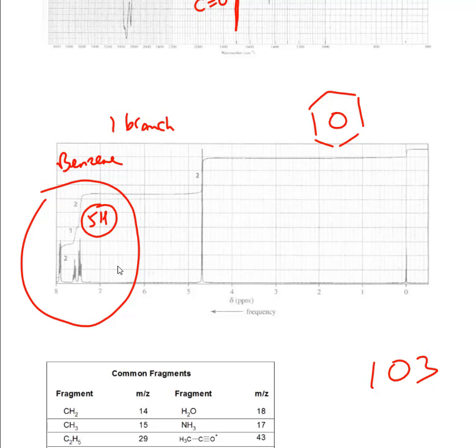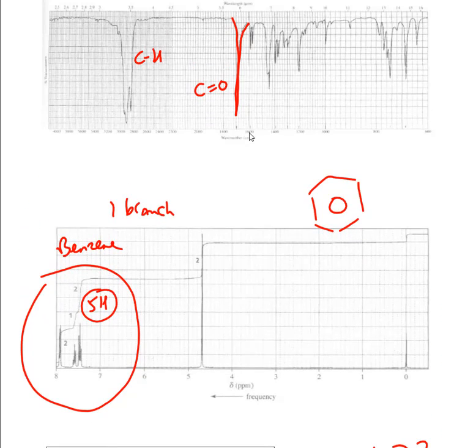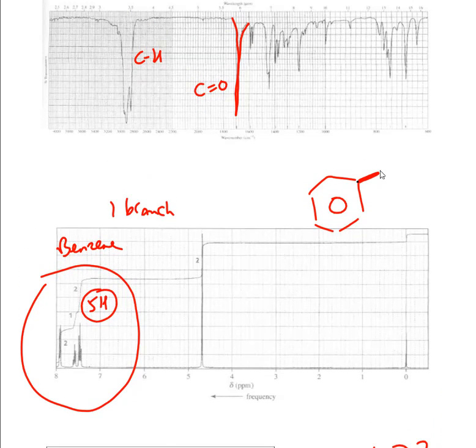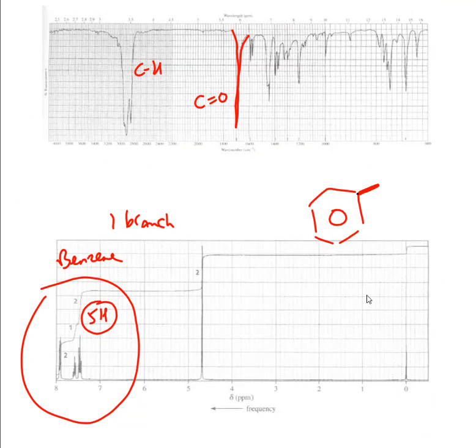Well, we know we have a carbonyl, right? That's told us right there. So we still have a carbonyl. So it's not like it could be an oxygen, then some carbon. It has to be a carbon, right? Because you can't have a Cl because Cl is terminal. So it must be at least a carbon here, right? And now we have to figure out, well, this is 7. We only have 1 carbon left, actually. There's not much to figure out. It's got to be like this, right?